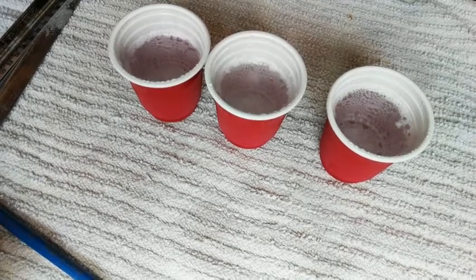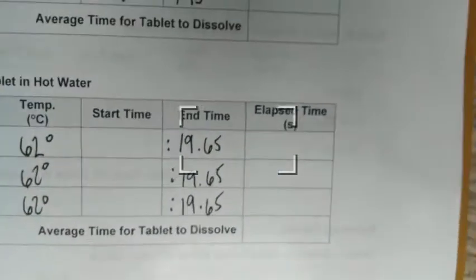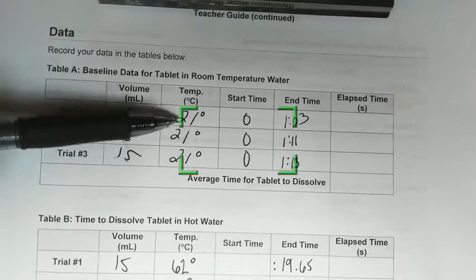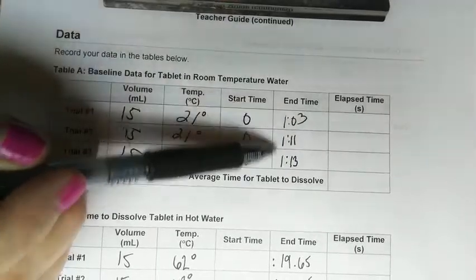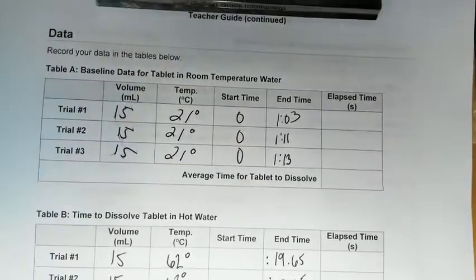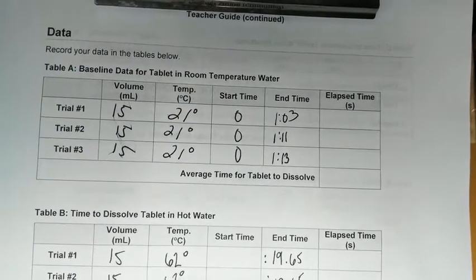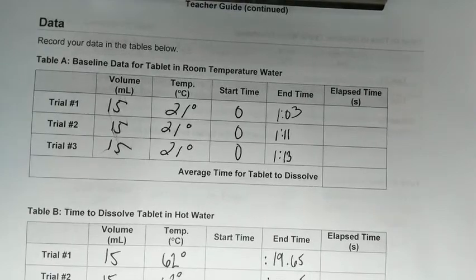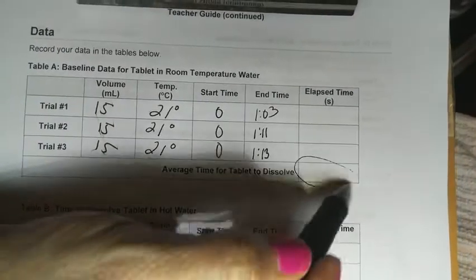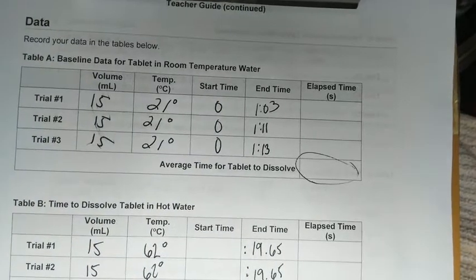Okay. So what I have now for all of them for the room temperature, we ended up with 21 degrees, and there's a little bit of a mix in here. That was the one where I put the water in after was a little bit different. So you have to average those together. Remember, when you do the average, you add them up and divide by 3.